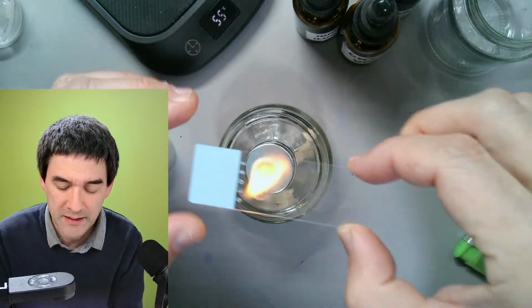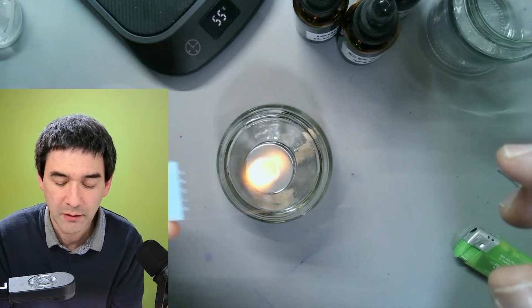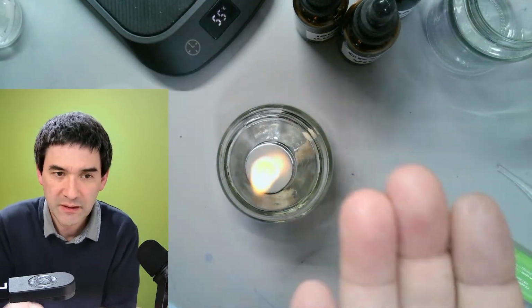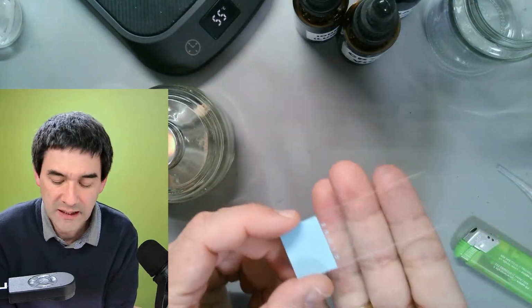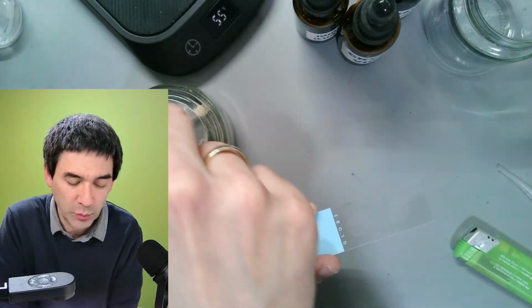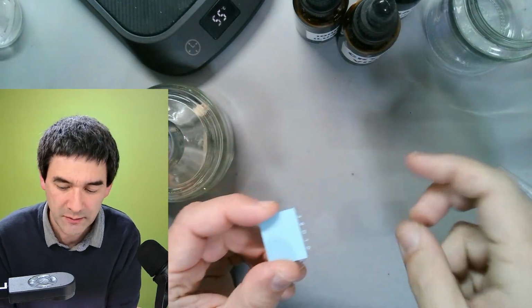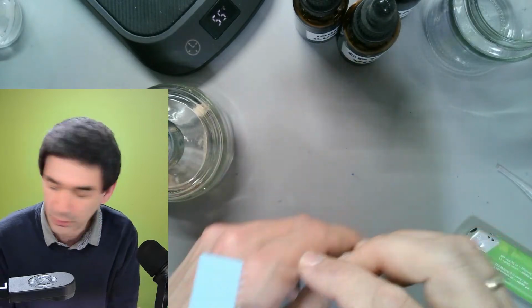So I will basically pull it through the flame here for a couple of seconds. I will test it. It's hot, so that's enough. Okay. I don't wanna burn the cells, obviously. Yeah. So I have to wait now until it cools a little bit. So I have to put it on a cool surface.